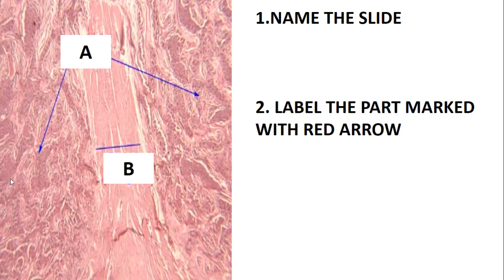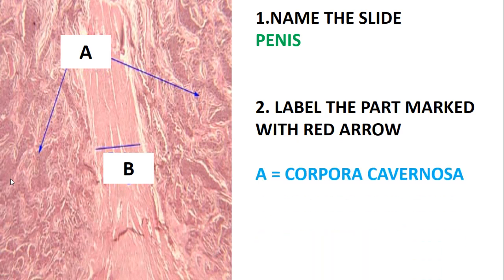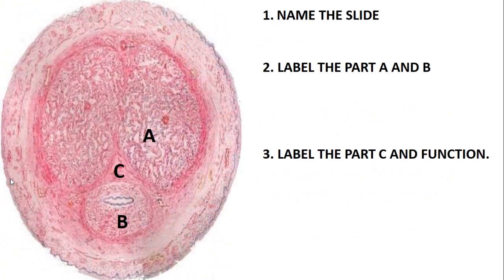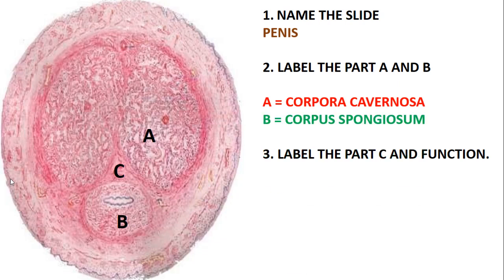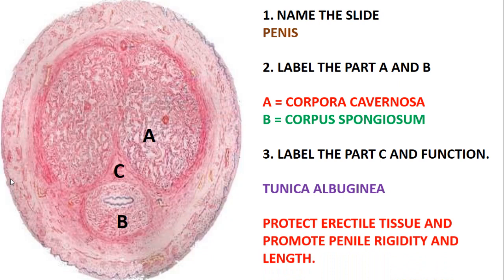Name this slide — this is the penis. Label the parts marked with letters: A is the corpora cavernosa and B is the tunica albuginea. Moving to the next slide, which is also the penis: A is the corpora cavernosa, B is the corpus spongiosum. Label part C and its function: C is the tunica albuginea, and its function is to protect the erectile tissue and promote penile rigidity and length.